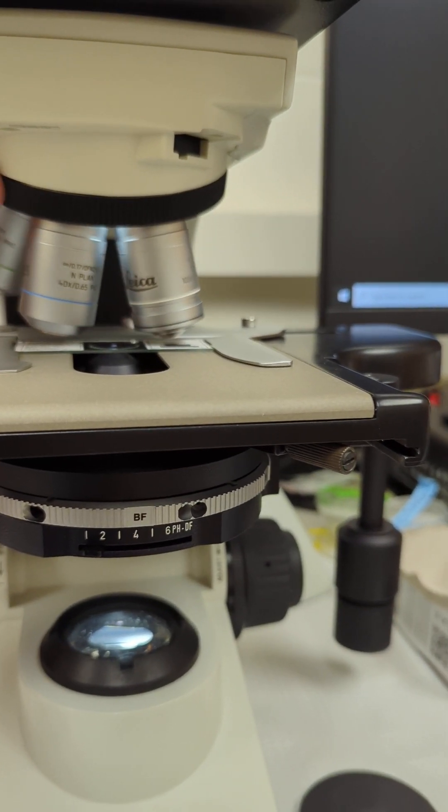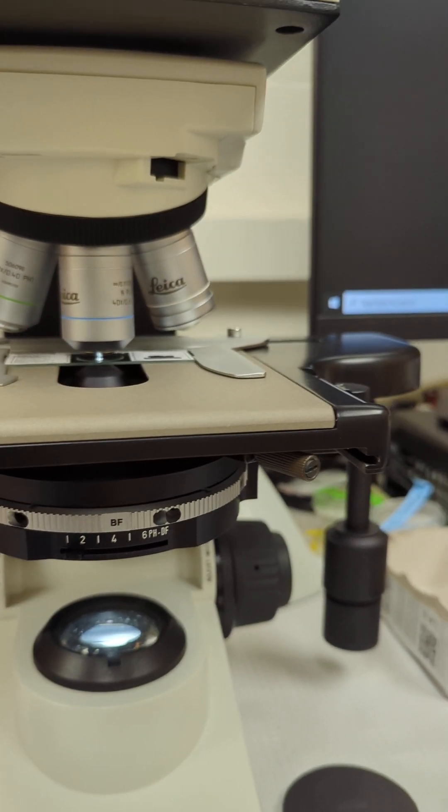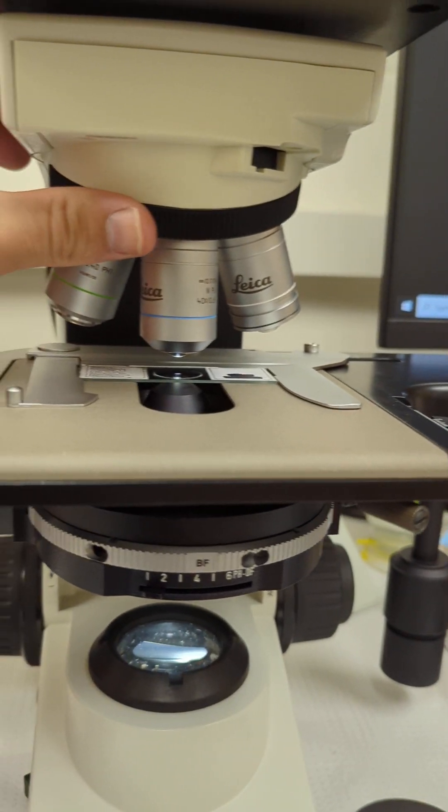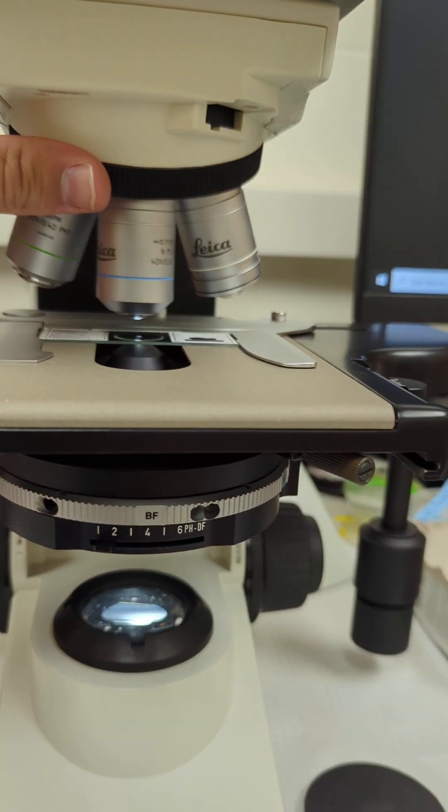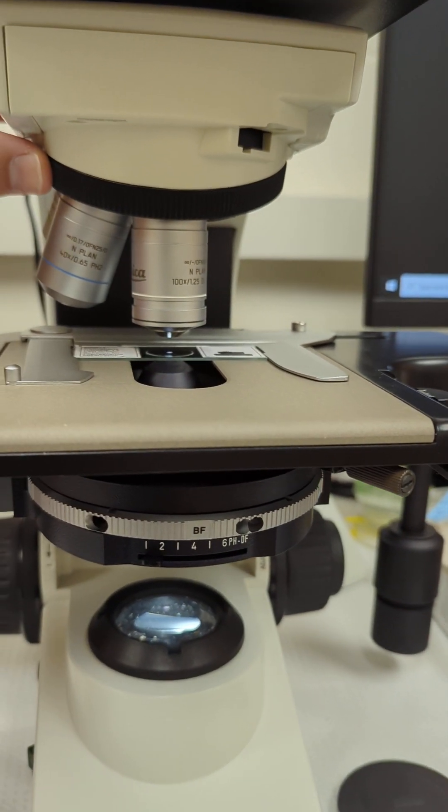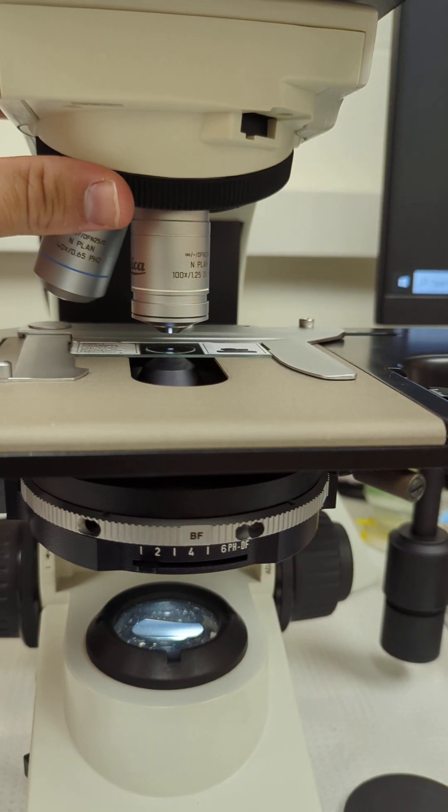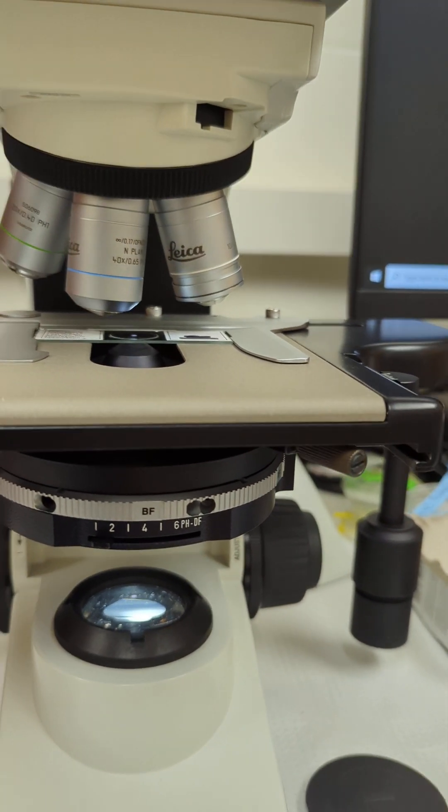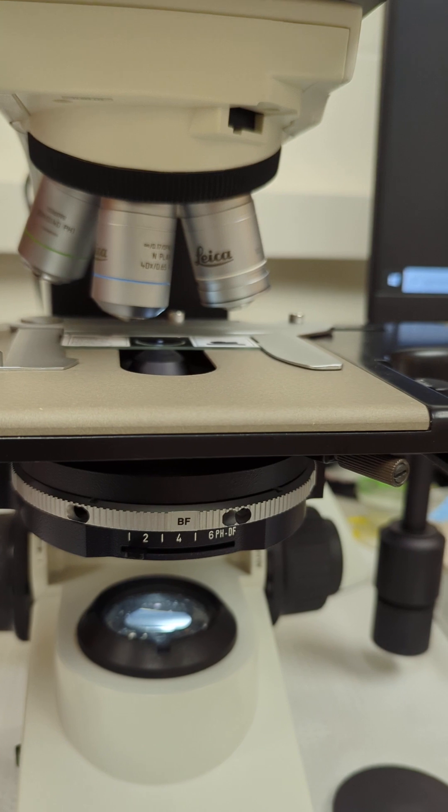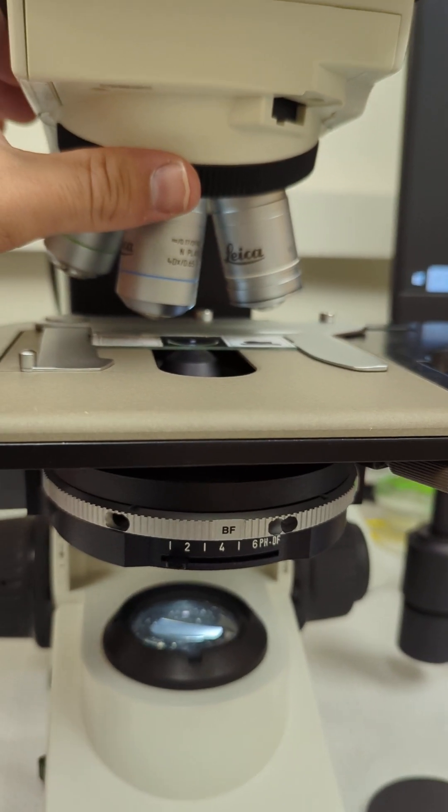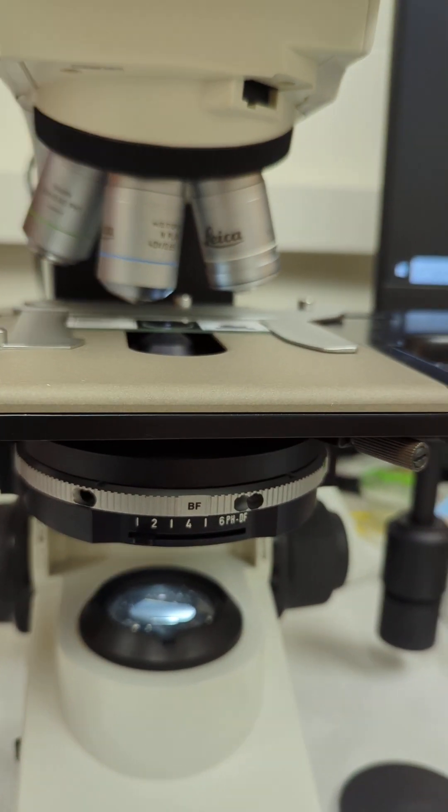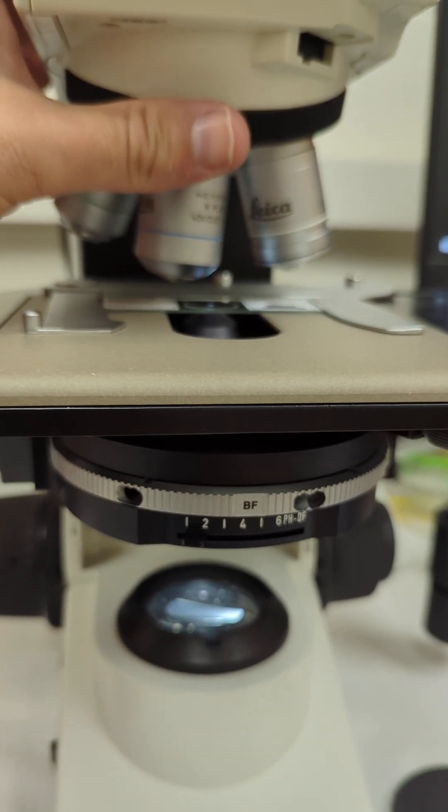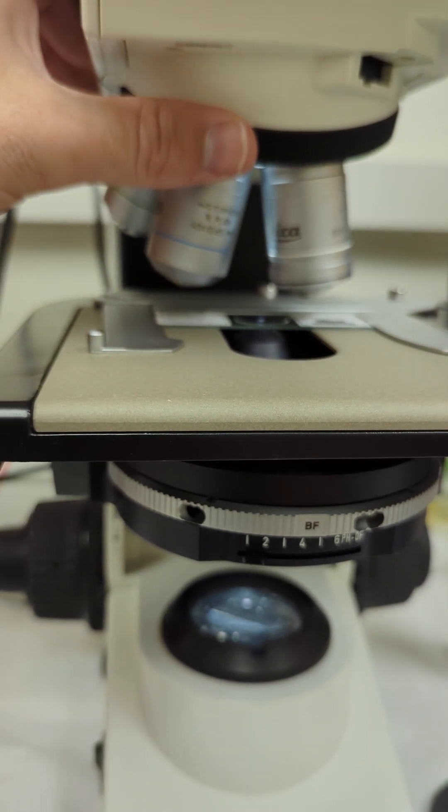When you're using your oil lens, which is this white ringed one, if you put oil on the slide, make sure you don't swing it back this way because your 40x and your 20x on this microscope will float through the oil and get dirty, and you'll smudge them and have to clean them.